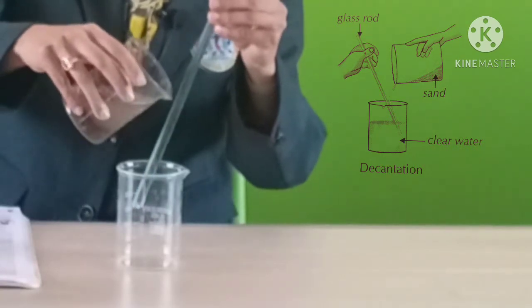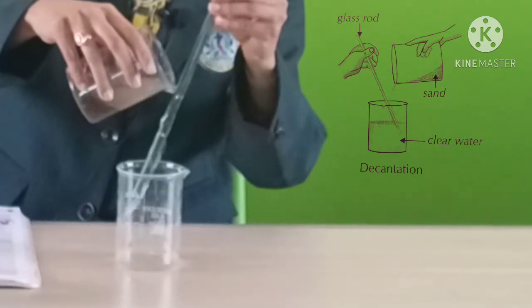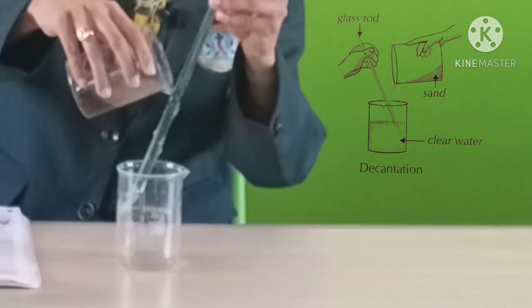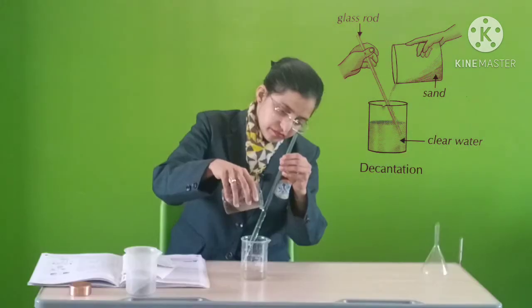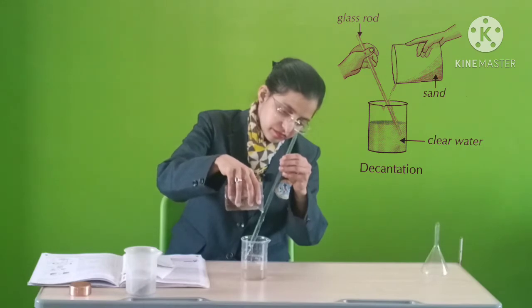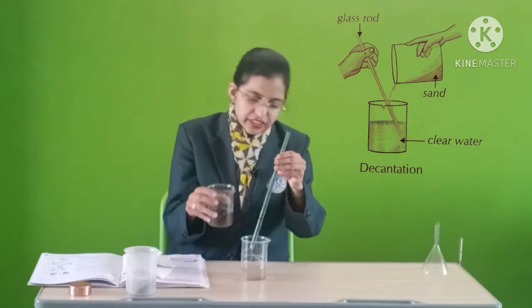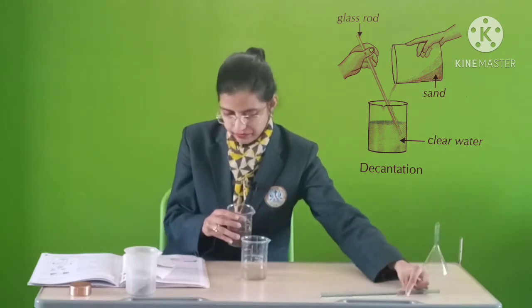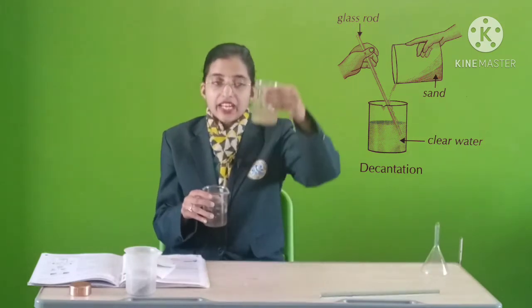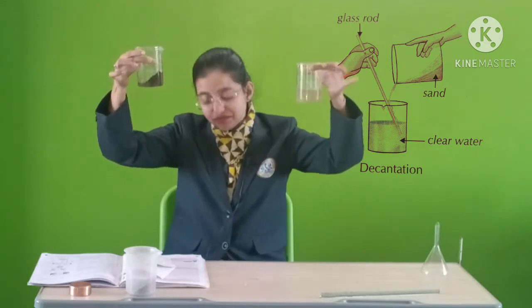Without disturbing the sediments, you will get the clean water. This process is decantation. I got water here and the impurities are here — both are separated. And now comes our next step.